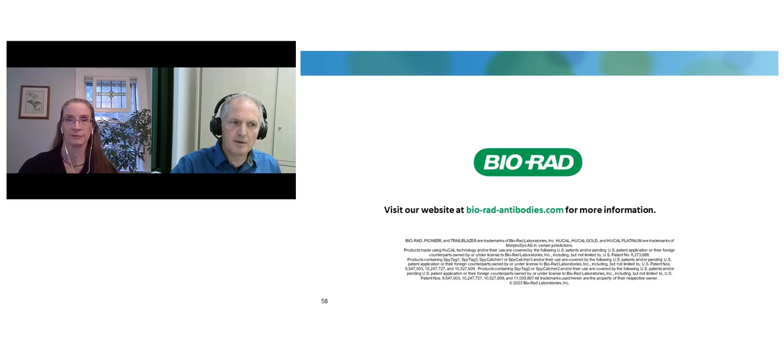The second important step is that you have a high quality library, so that ideally the whole library space is really filled with sequences which can be displayed on the phage. So you always have some cloning artifacts, stop codons, and so on.